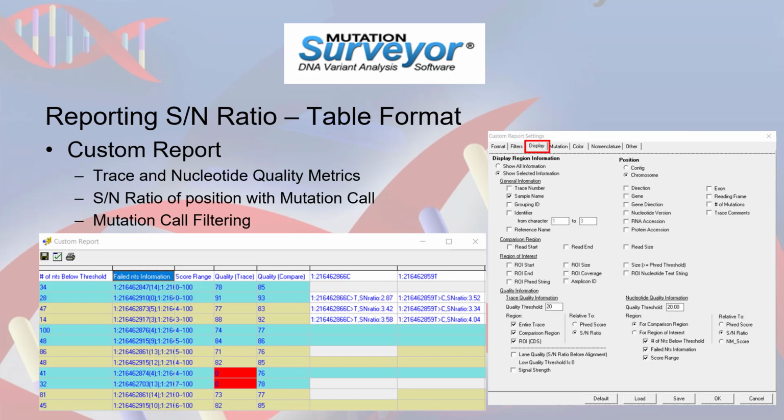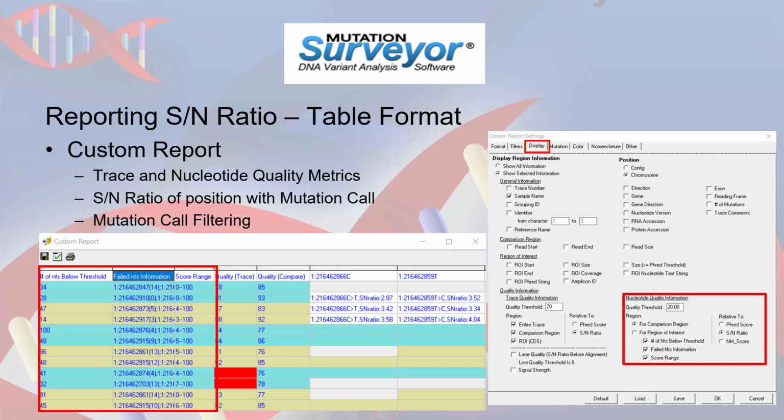Under the Quality Information section, use the left settings to output quality information relative to signal-to-noise ratio for the preferred regions of the trace. Like the HGVS report, a threshold can be set to flag any traces with values below this threshold. Use the settings on the right side to output single nucleotide quality information. After setting your preferred threshold, different metrics can be selected to report.